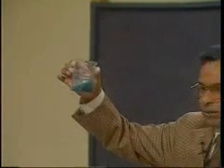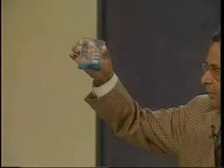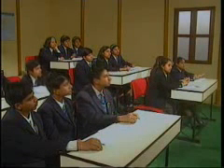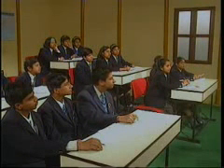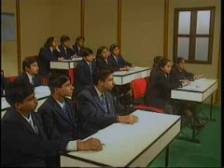Are you seeing some change taking place? Yes, sir. What initial change will you see in this case? So the color is changing. It is becoming lighter and lighter, and I'll show you what is happening to the zinc metal.